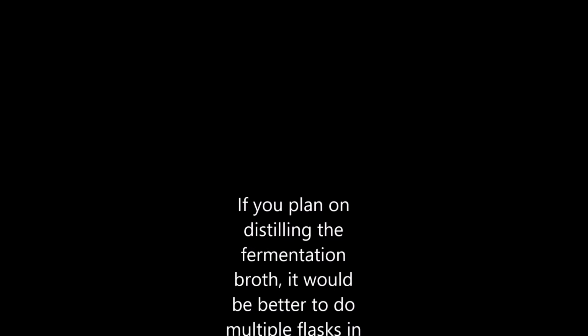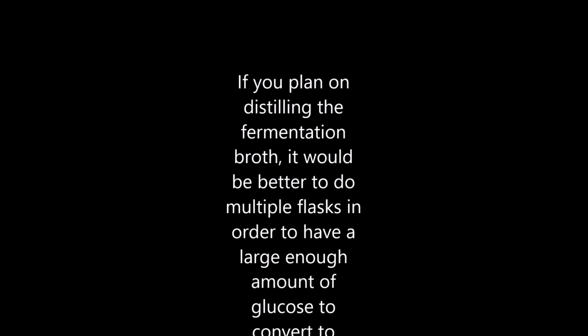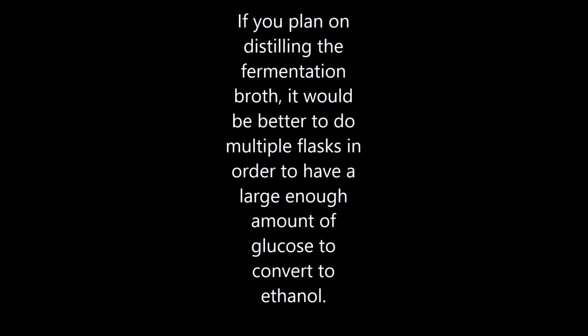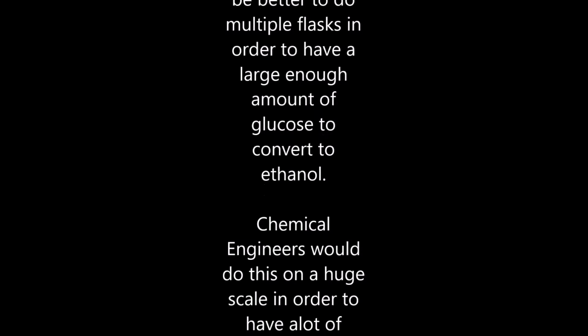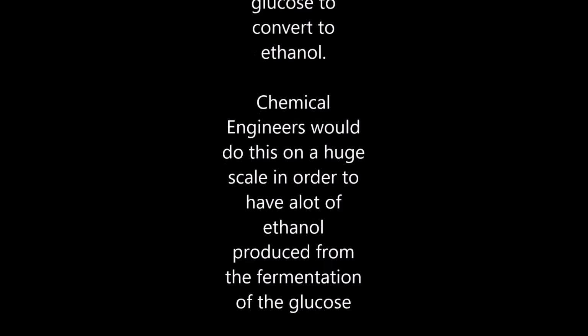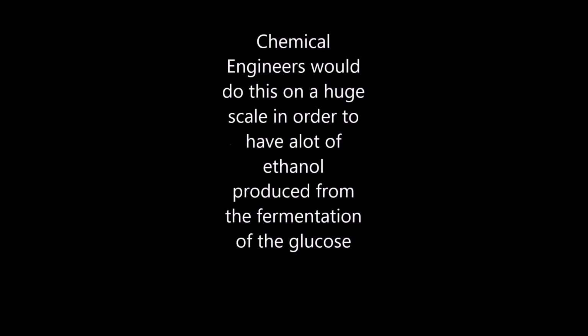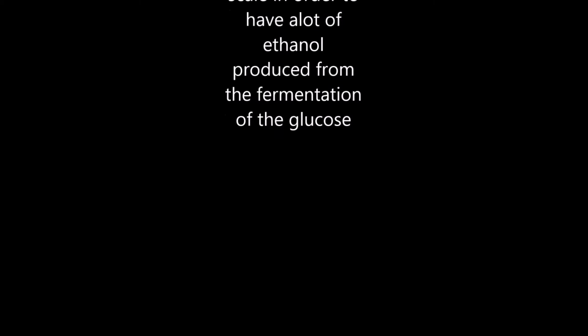After fermentation is done, glucose readings should be at 0. This is shown by a low reading on the meter. At this time, the contents of both flasks can be poured down the drain, if you choose to not use the solutions for distillation. The airlock should be removed and a rubber stopper should be inserted in its place. Both flasks should be then placed in the refrigerator until you are ready to begin distillation. Once the experiment is concluded, clean up the area and wash your hands before leaving the lab.